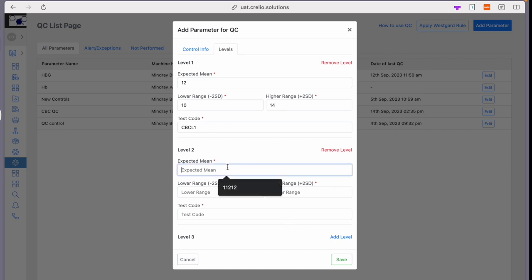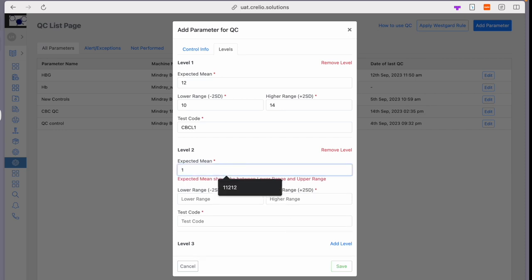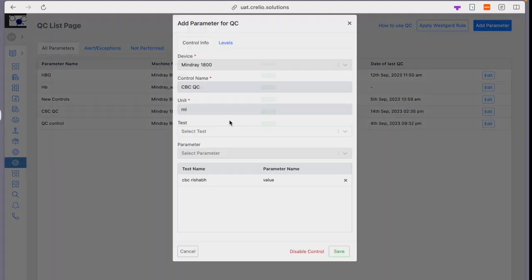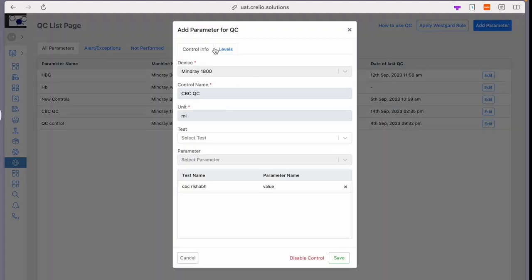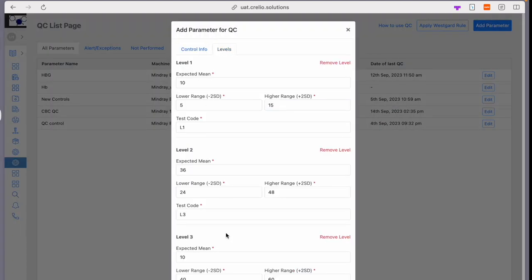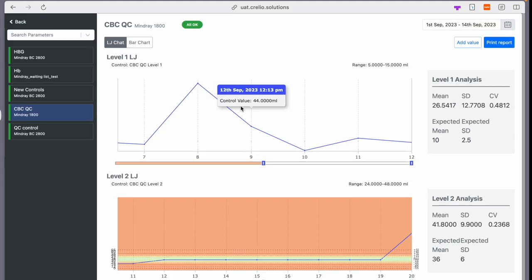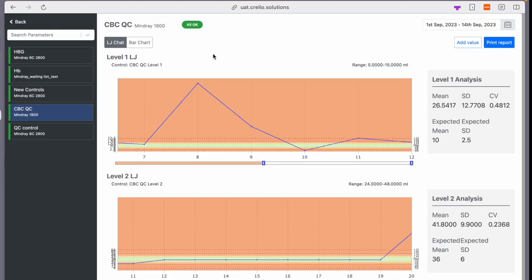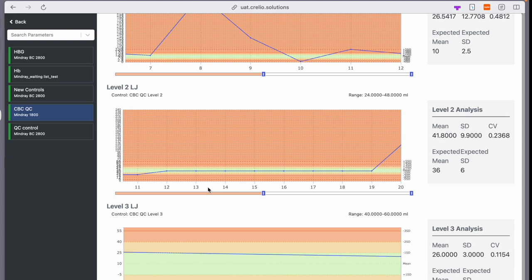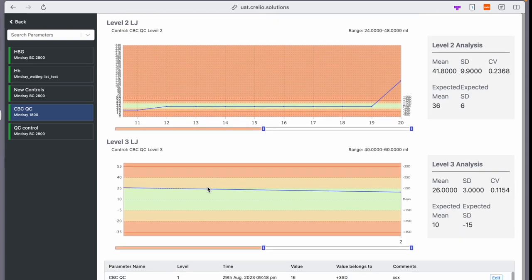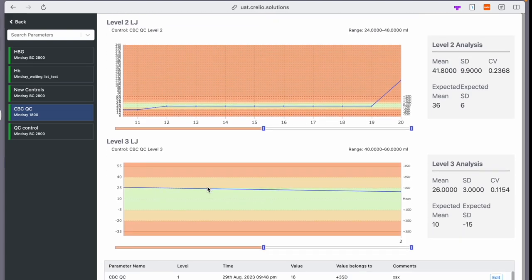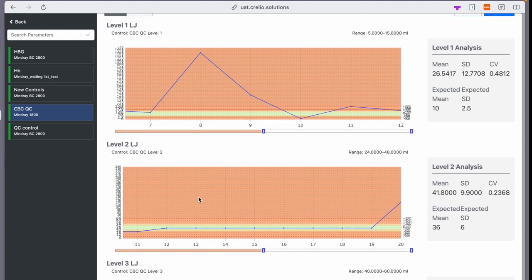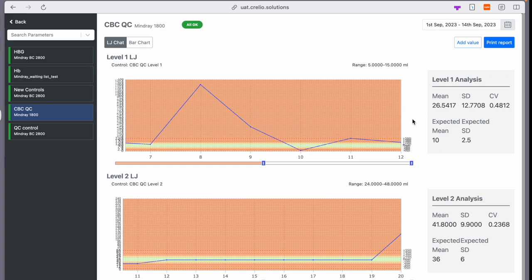the other levels, and once configured, it will look something like this where all level data is added. Once it is configured and interfaced, if you click on the control name, you will see all the QC values in the LJ chart - all three levels data together, making it super easy to use and analyze those QC values.